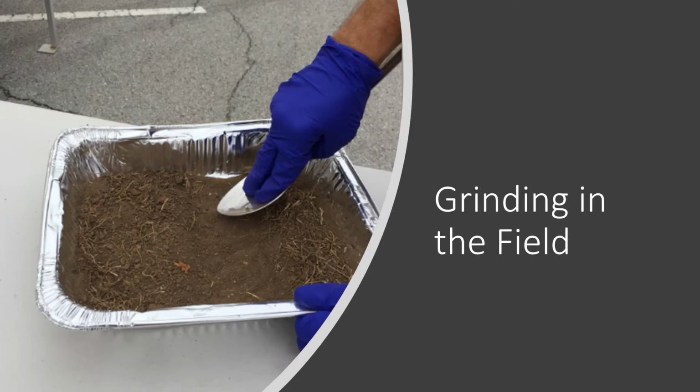Sample grinding may be a sample processing step that can be performed in the field if a goal is to reduce soil particle size heterogeneity. Breaking up soil clumps can also facilitate sieving. In the lab, this is done with tools such as a puck mill. In the field, that type of tool would be impractical due to decontamination concerns. However, soil clumps can be disaggregated by hand pressure using a stainless steel spoon to reduce the size of large soil particles.